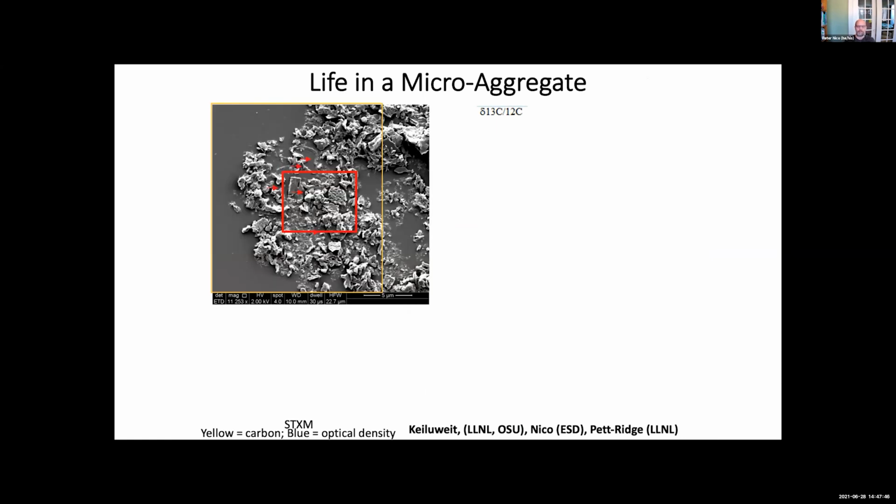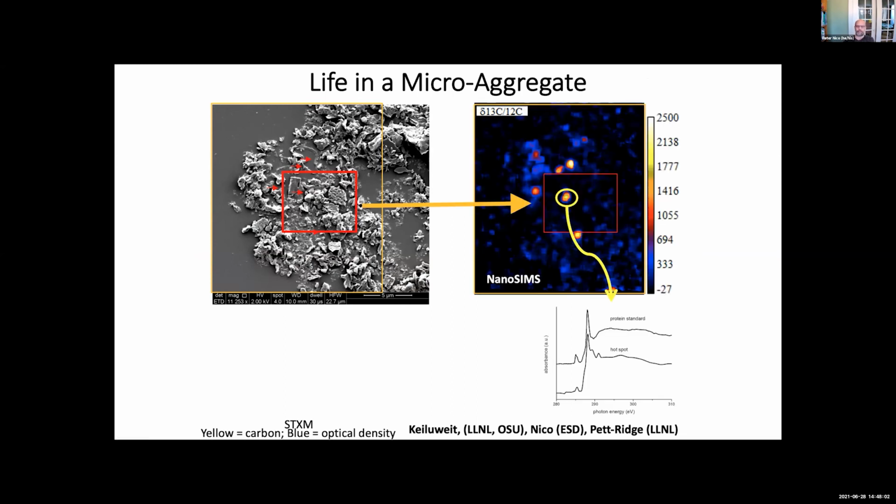So at great effort, Marco Kaluait and Jeremy Micron, as a postdoc, made a cryo thin section of a soil microaggregate at this location. And this was after incubating it with 13C CO2. So again, we can get a NanoSIMS spectra of this area, and we can see certain hotspots, presumably active microorganisms that show up in this area.